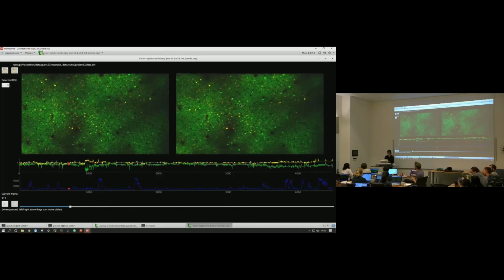So with the non-rigid, that's taken care of by the interpolation, so everything will get filled in, but the edges will look funny. If things are moving non-rigidly, you'll see weird wavy things. And with the rigid, we use np.roll, which literally just goes backwards, so you get the other side of the plane on the other side. It's just what happens. So that's also the reason why you don't want ROIs on the edges.